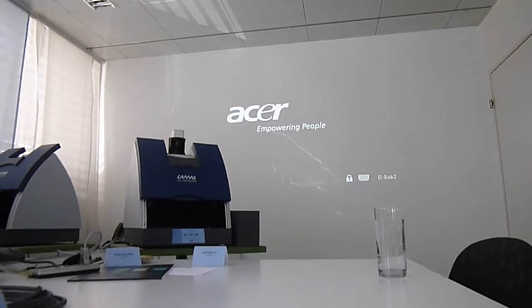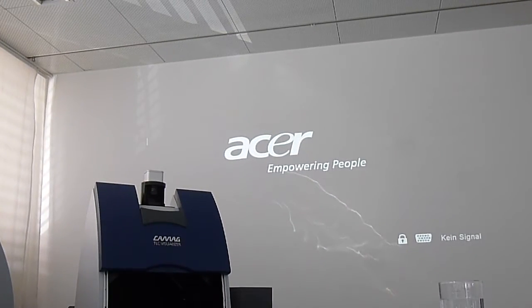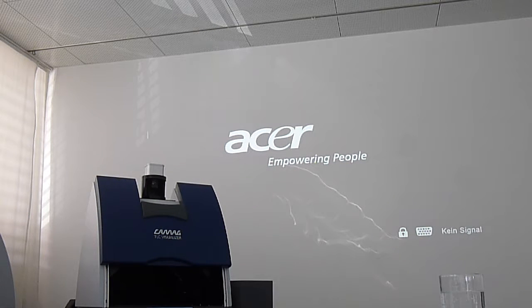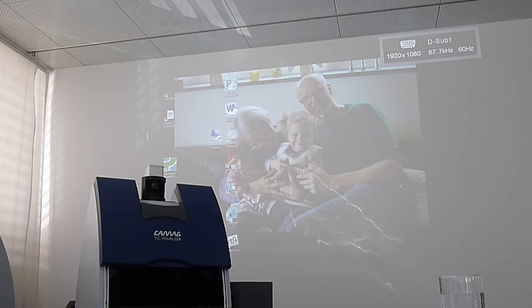Is it 2 or is it? I never know which signal it is. That one. Okay. And we have now, yeah.